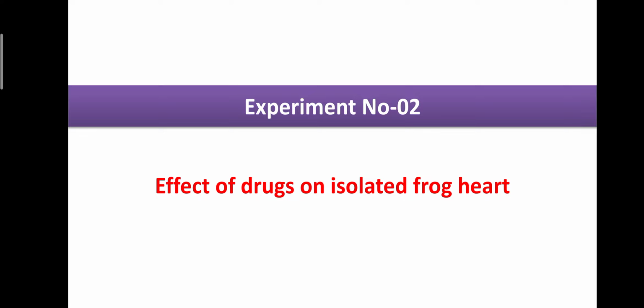Today, we will learn about the effect of drugs on isolated frog heart preparations.